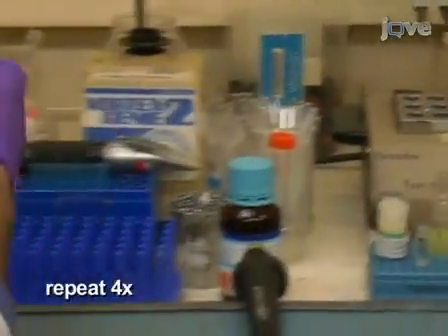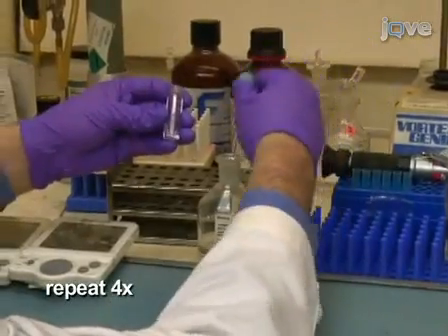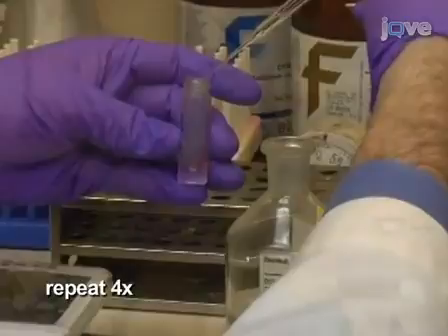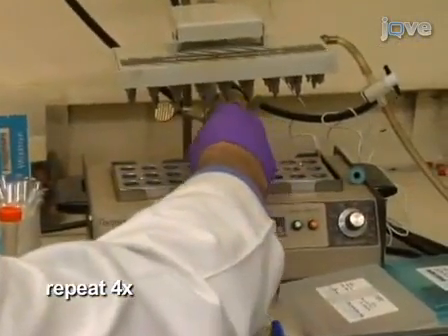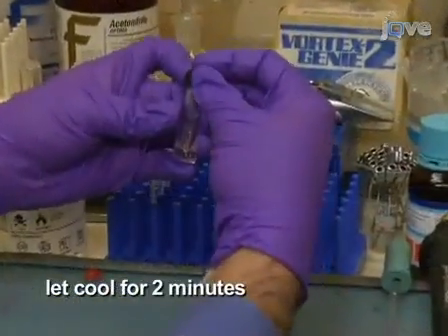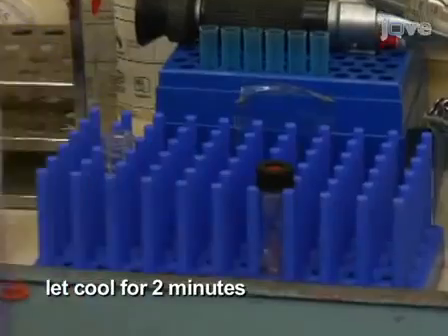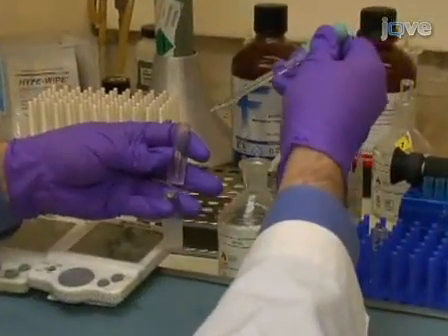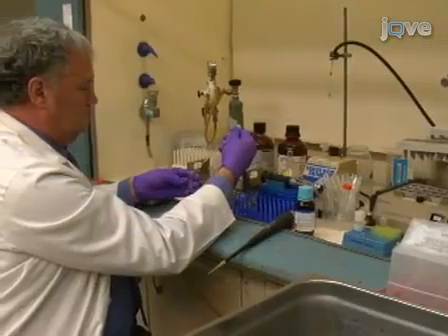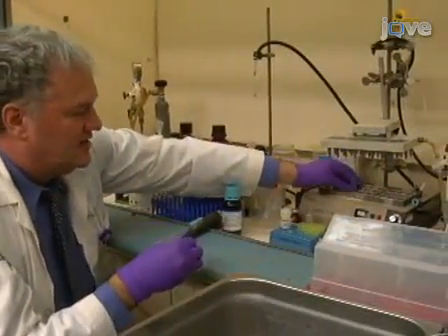Again, top off with acetonitrile and place under a nitrogen stream at 70 degrees Celsius until a constant volume is achieved, repeating up to 4 times until a precipitate forms. This takes about 10 minutes each time. After dehydration, let cool for about 2 minutes. Top off with methylene chloride, being careful of boilover, and dry. This takes about 4 minutes. Top off with methylene chloride and dry one more time.